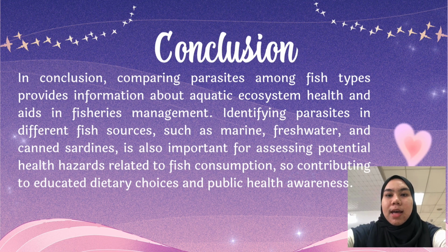Identifying parasites in different fish sources such as marine, freshwater, and canned sardines is also important for assessing potential health hazards related to fish consumption, so contributing to educated dietary choices and public health awareness.